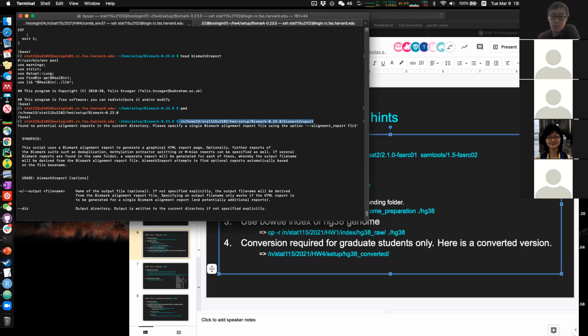by default, if we do not specify, try to install everything on your server, in your Canon home folder, or wherever you want your working directory to be. As I said, you can definitely do everything locally, but we don't recommend that because that would be computationally very heavy, and it also takes a lot of disk space. Also, we already set up this environment on the server, so that we're trying to make a uniform environment so that we can all start from the same page. Otherwise, you might have different versions, etc. Okay.